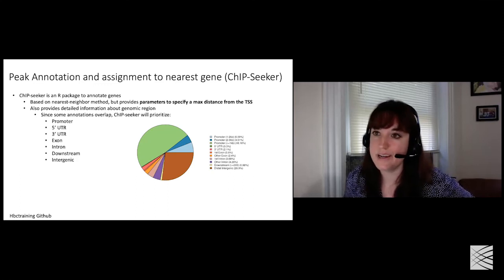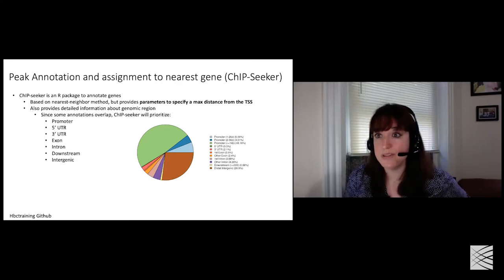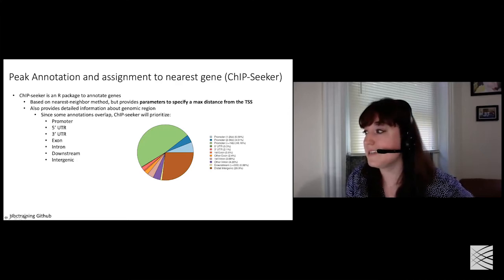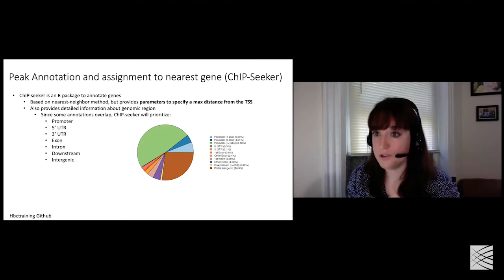And if you decide that, in an ATAC-seq data set, most of your peaks are not assigned to promoters or near a promoter, then your annotation is probably incorrect, or your experiment didn't work. In a typical ATAC-seq, because the regions are the most open, the majority of your peaks would lie within 10 or within 1 kb of the promoter.